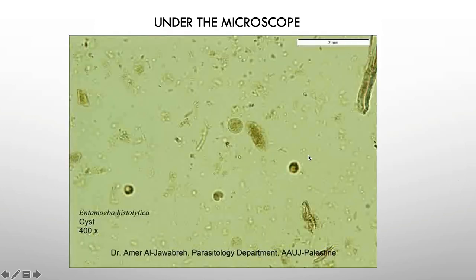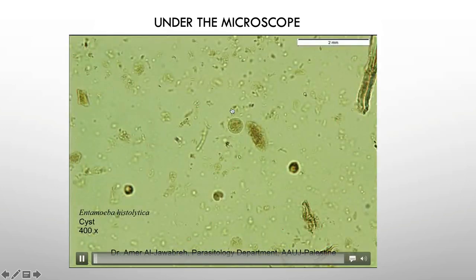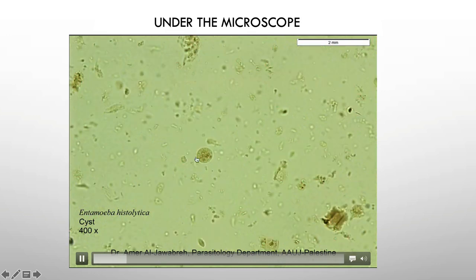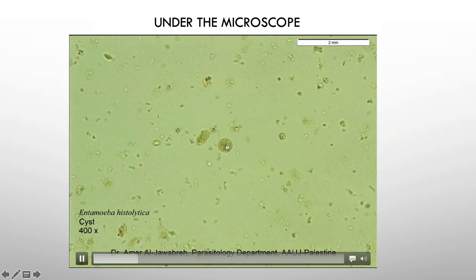Let's see here under the microscope. Okay, you can see here the cyst. Okay, this is the stool sample and this is the cyst. You can see here the cyst. Okay, this is the cyst.